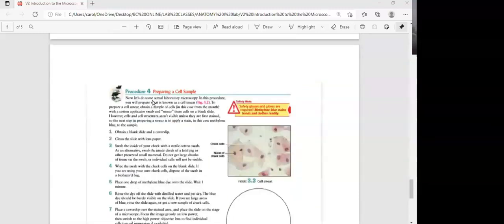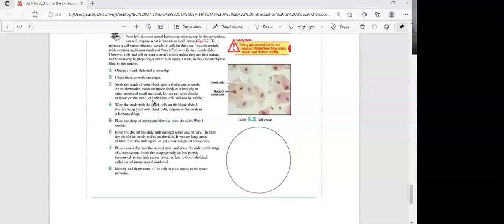After students begin to practice with the letter E, they get a slide like this. Now they need to identify things themselves, right? So now, this is one cell right here, right there. This is another cell. You can see right like that. This is another cell. We have another one right here. But I want you to see one thing right here. You see the other one is kind of, if you use your imagination, kind of like on top of that, right?